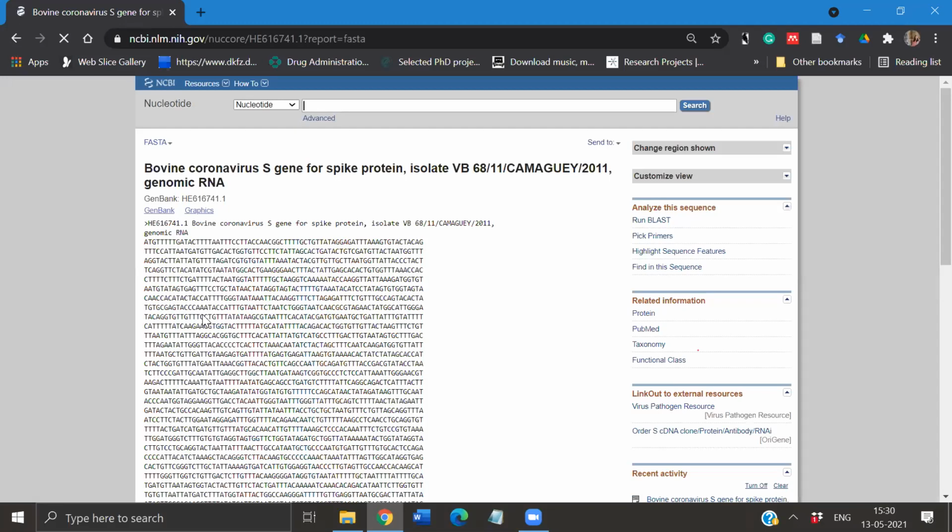So this is the FASTA format. As mentioned in the tutorial video, the FASTA format has this definition line. In this definition line, this bracket is very important. If you are copy pasting the sequence, and while doing that this bracket somehow gets deleted, your sequence will not be identified as a FASTA format. And that's why some of the bioinformatic software may give this as an error.